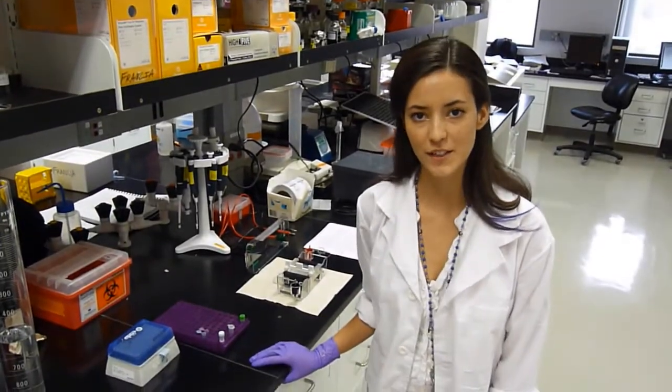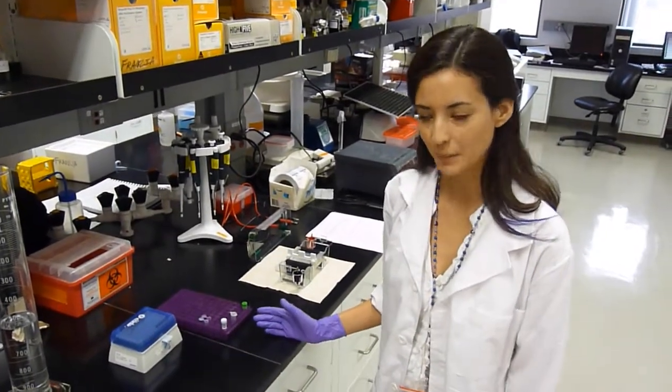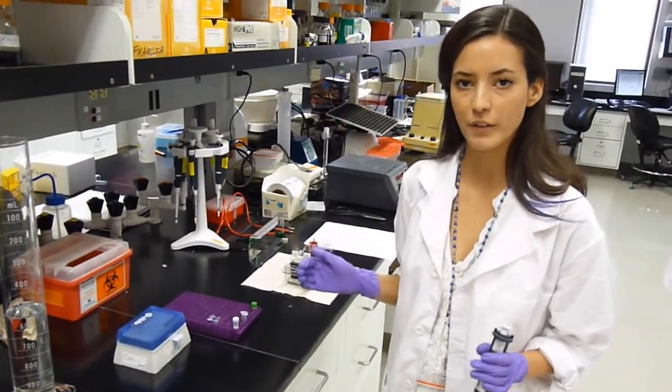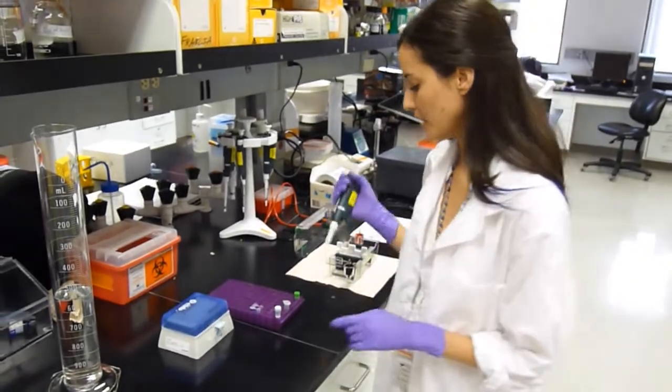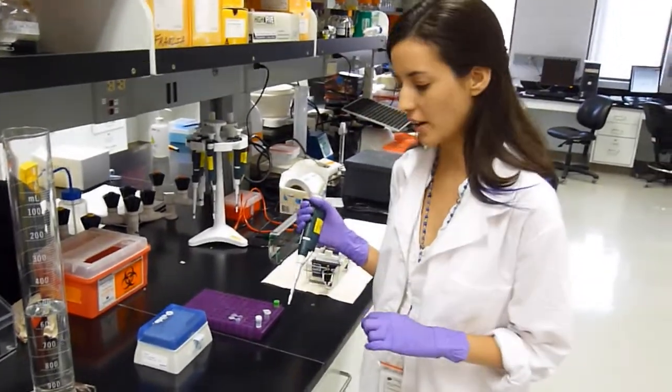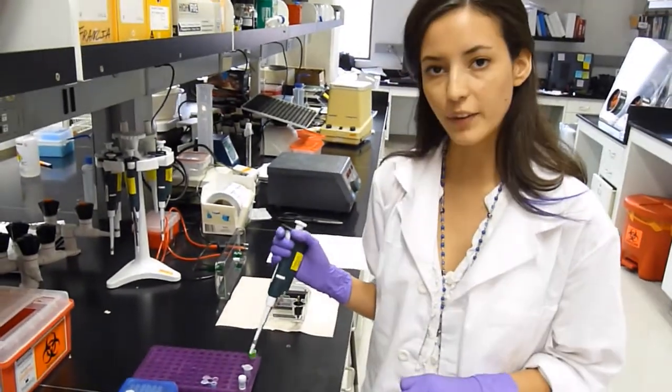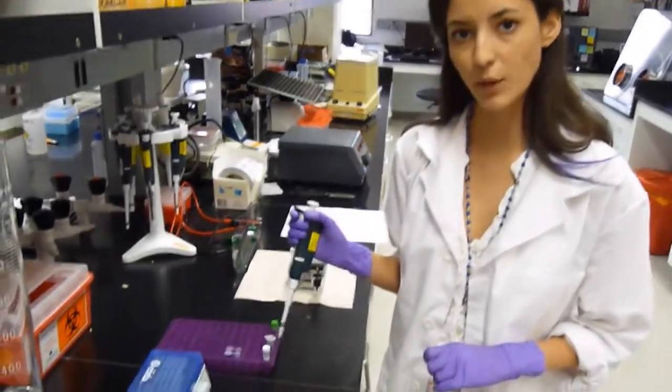While we wait for our gel to set, let's prepare our DNA samples. You want to prepare your samples to a volume that will not overflow your wells. Because we're making a mini gel, I'm going to add 5 microliters of my DNA sample and mix that with 3 microliters of my 10 times loading buffer.